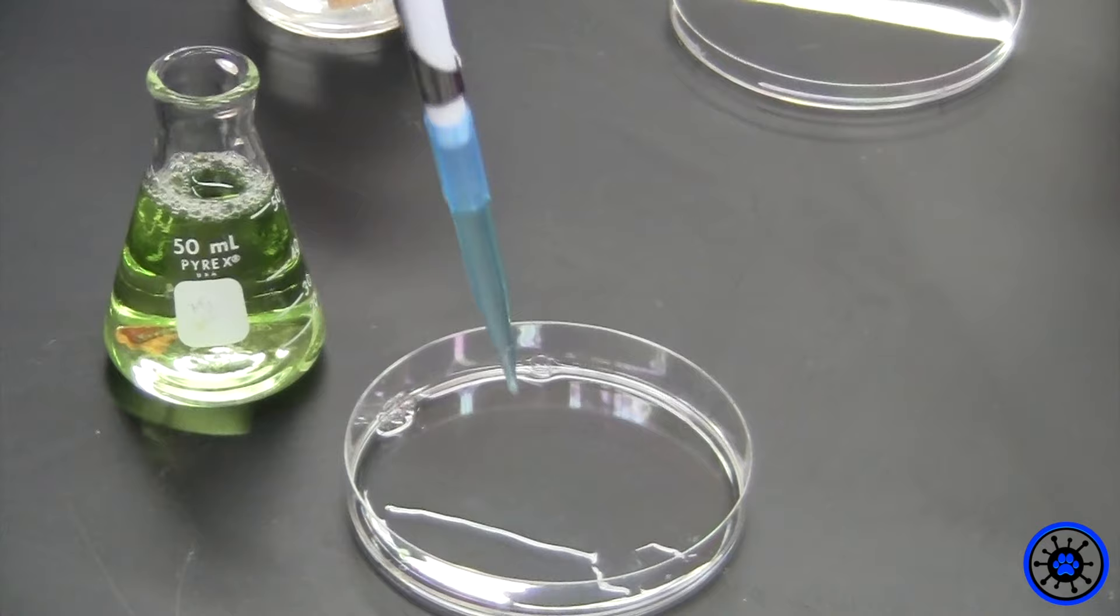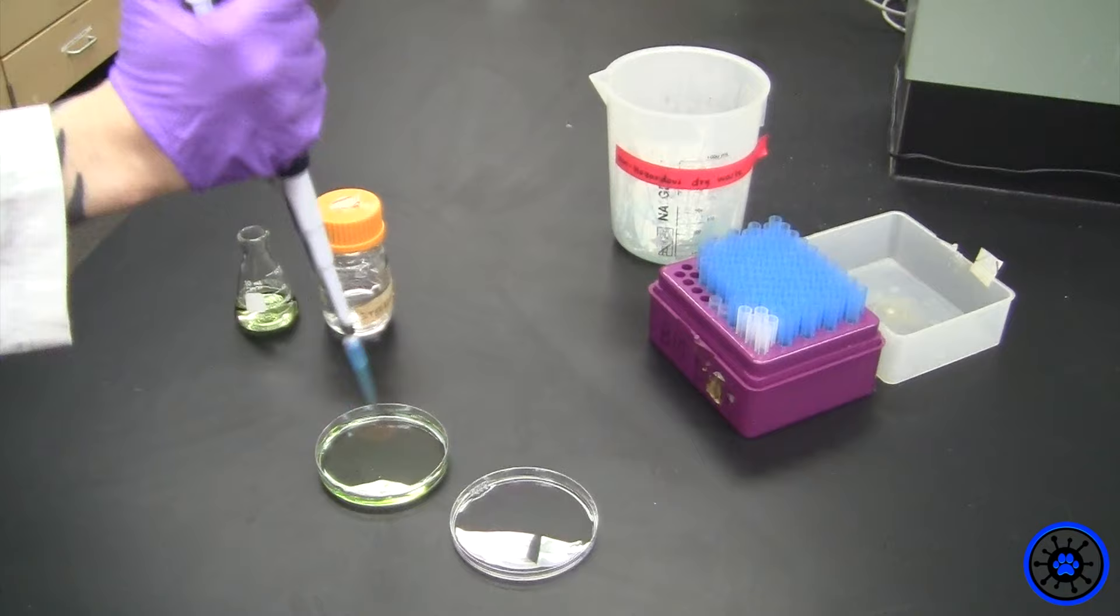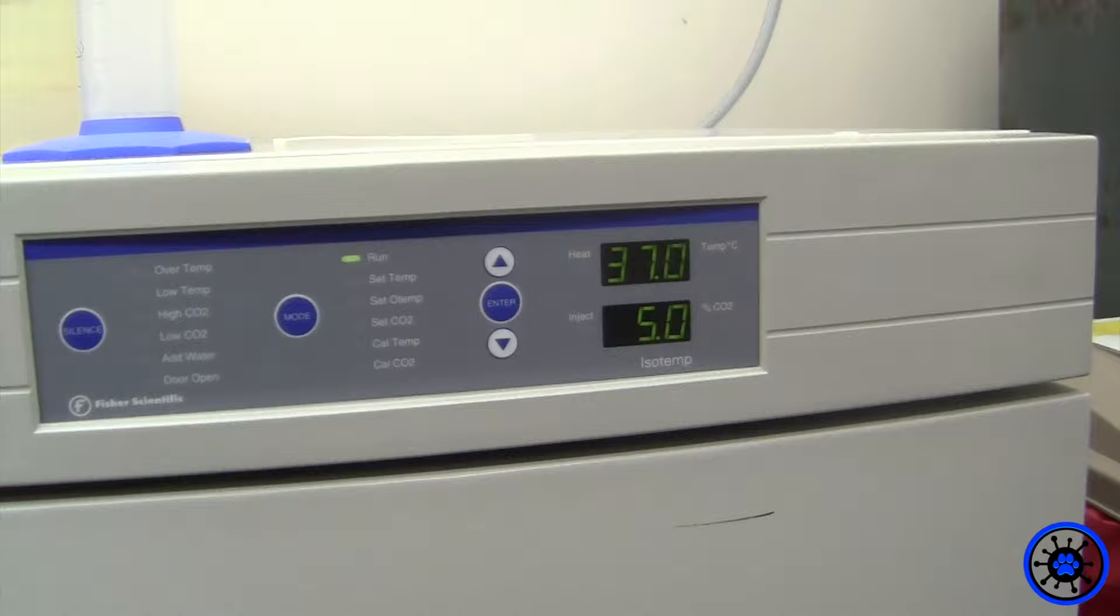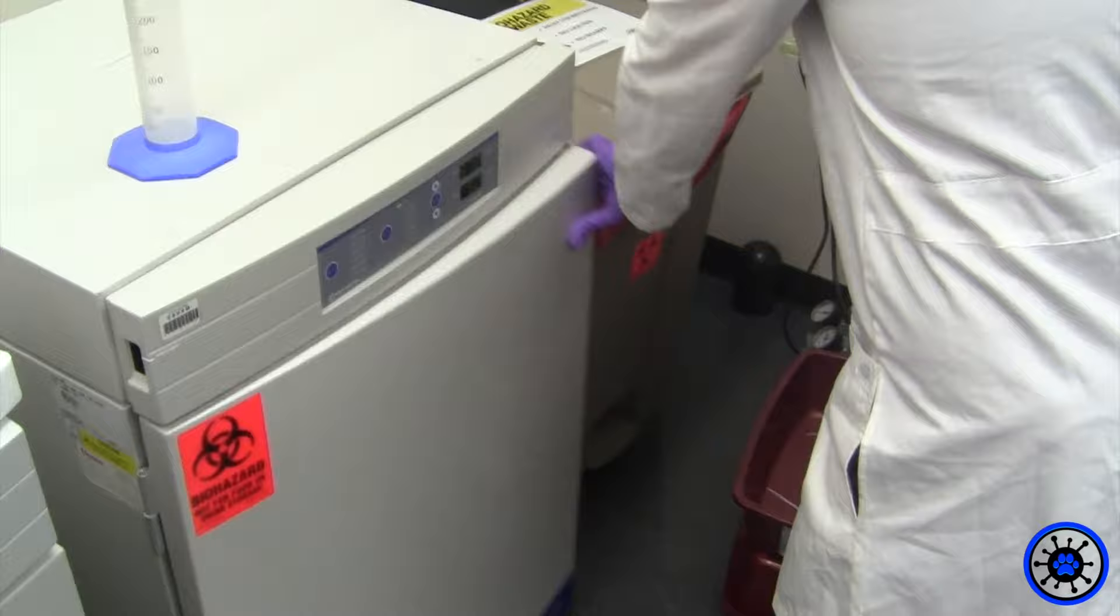They are then cleaned with PBS and have their adherence to the dish removed by trypsin. Then the suspended cells are passed to a new dish containing fresh media culture and left in an incubator at 37 degrees C and 5% CO2 until their next passing.